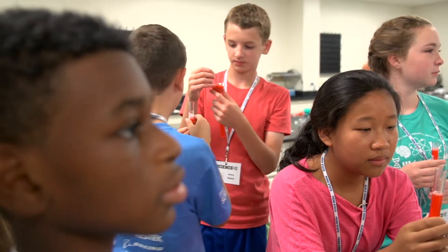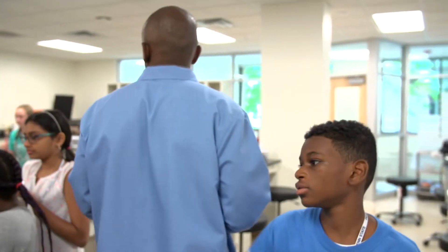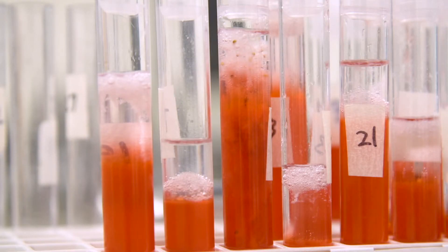I had like the first and second most DNA. I want kids doing science in community because I want to develop a sense of a community of scientists. It's all about collaboration and communication and co-discussion and co-sense-making. Some people had very particular methods for mashing them up. If you mashed them up less, do you think you'd see less DNA? If you used a larger or smaller strawberry, do you think you'd see more or less DNA? That's a hypothesis — we can test that using the same method.